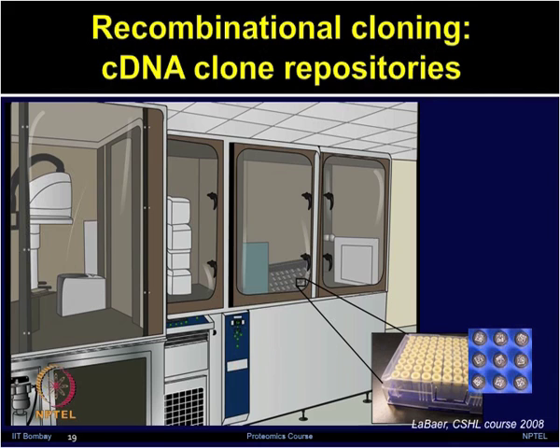Now, these genes are generated from the recombinational cloning, which we discussed just a few minutes ago. These have no restriction, they can be transferred into any format, into any vectors. These genes are broadly available, there are no restrictions, there is a flexible format, and they are expression ready, sequence verified and foldable. All these clones are stored in these automated clone repositories, so that each tube which contains the full length coding region can be taken out from the system without affecting the other clones.